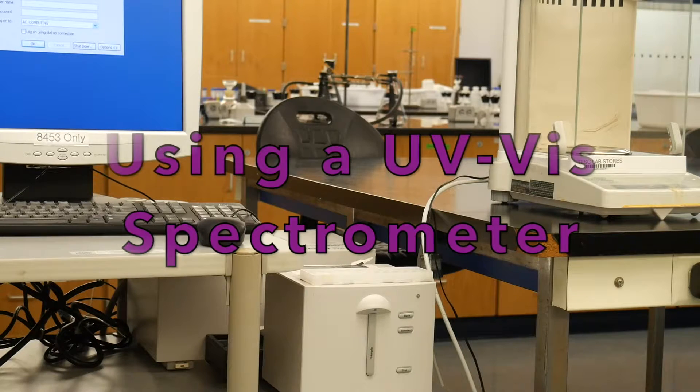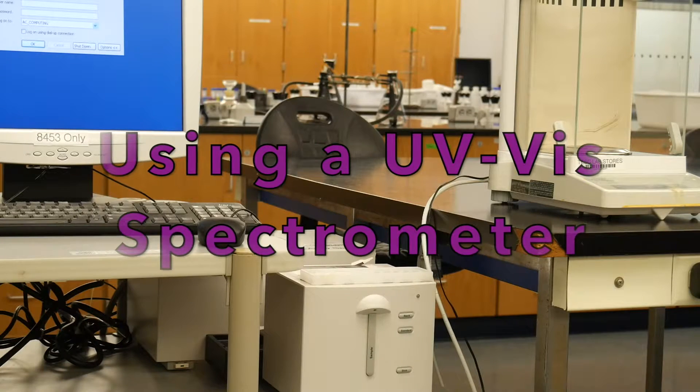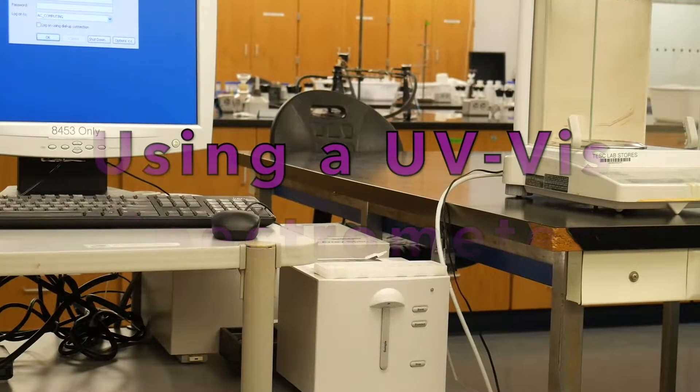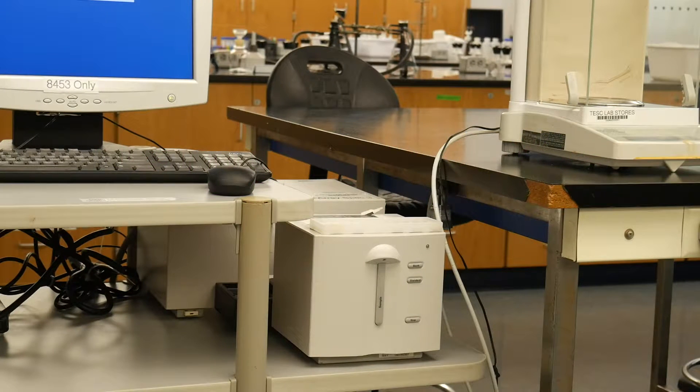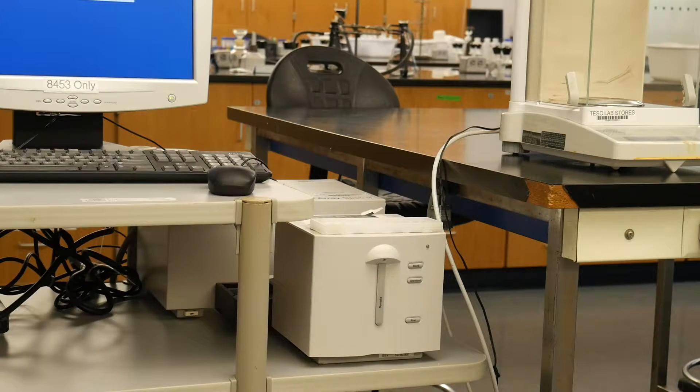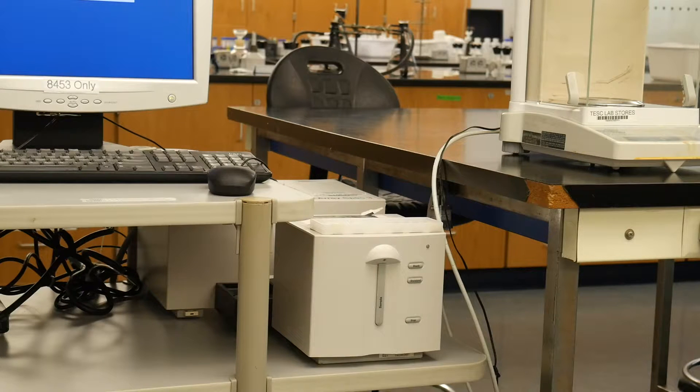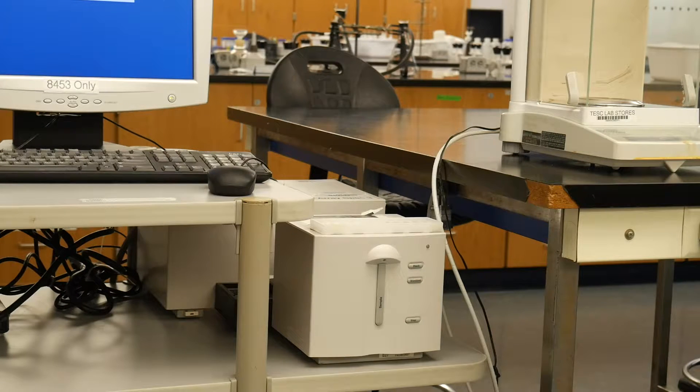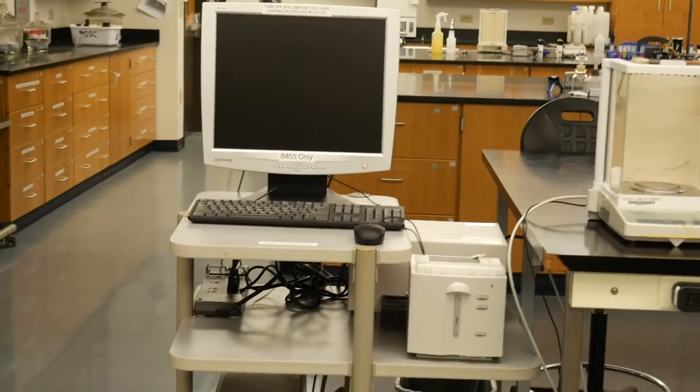Hello! Today we're going to be learning about how to use our UV-Vis spectrophotometers. Here at Evergreen we have a couple of different models that get used, so I'm going to show you both of them. They are both running off of the same software, so there's only a few differences between them.